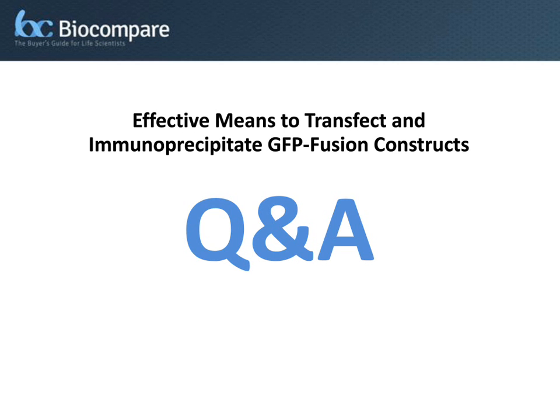When it's not, for example, for lineage tracing over multiple days, something like a lentiviral approach would make more sense. Okay. All right, thank you.